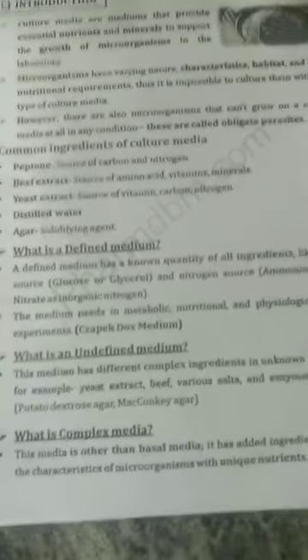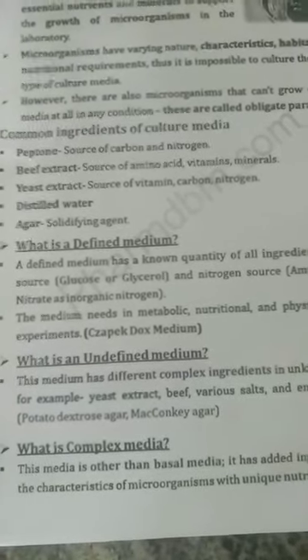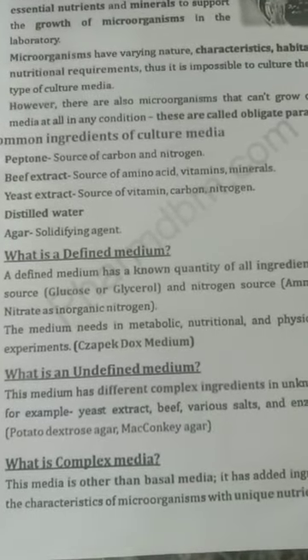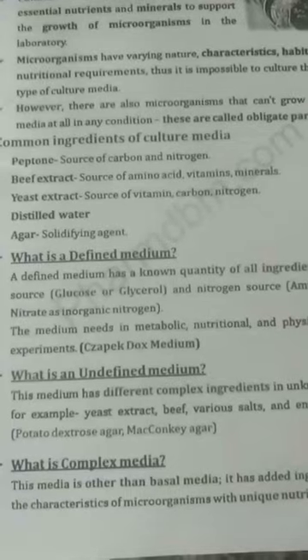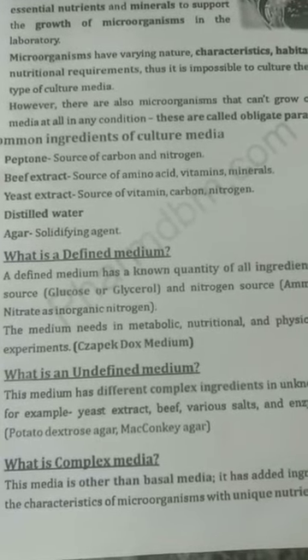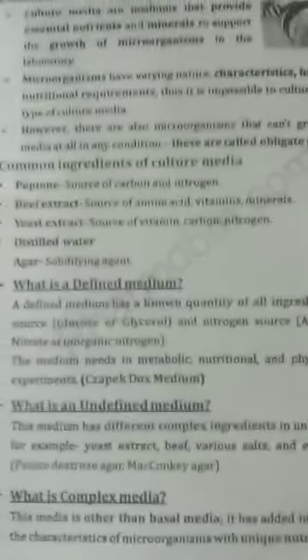Common ingredients of culture media: peptone is a source of carbon and nitrogen. Next, the second one is beef extract, a source of amino acids, vitamins and minerals. Yeast extract, a source of vitamin, carbon and nitrogen. Distilled water, and agar, which is a solidifying agent.